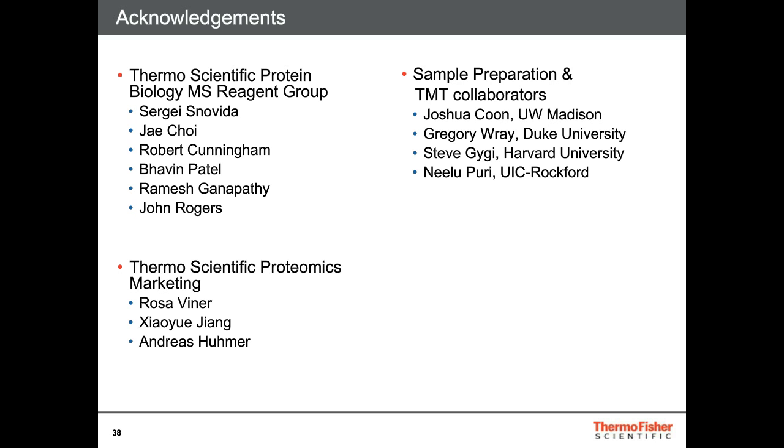And I will say that I won't be able to go into much detail on the software, but the second part of this webinar series will be much more in depth on MS acquisition methods for TMT labeled samples, as well as phospho TMT labeled samples, phosphopeptide-enriched TMT labeled samples. In that, we'll have a speaker go through the Proteome Discoverer workflow and cover data analysis specifically for TMT. Okay. Can you further comment on the method to minimize compression phenomena using the Fusion?